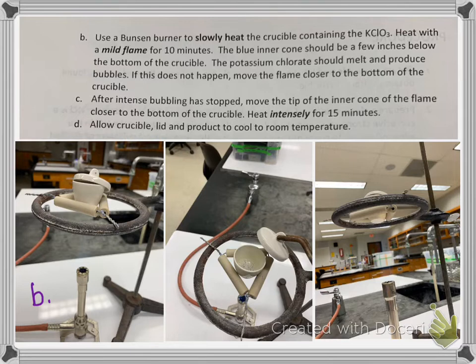I tried to show you here the bubbles that are coming from the potassium chlorate. So you can see it actually turned into a liquid. And if you had been in lab, you would see there was a lot of bubbling going on. And at different points there was more bubbling as it went on.